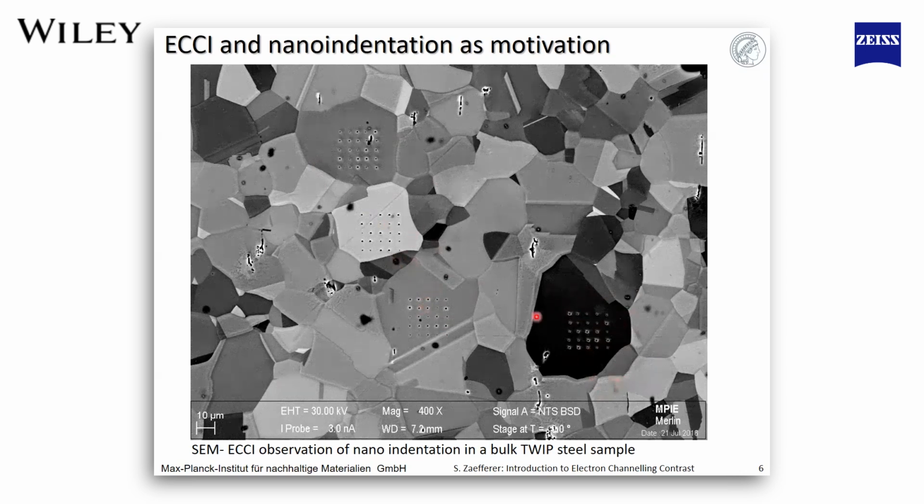and which ones are really systematically created, caused by the particular orientation of that grain. We would also be able, of course, to go to twin boundaries here, for example, or to grain boundaries here and observe how they behave.